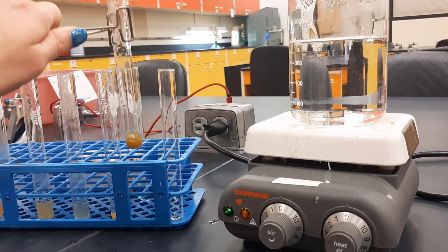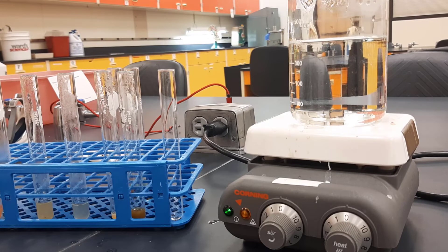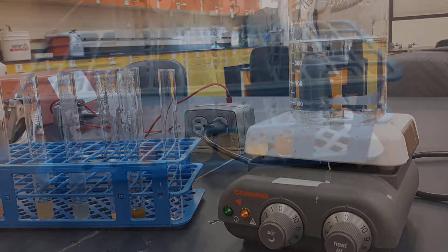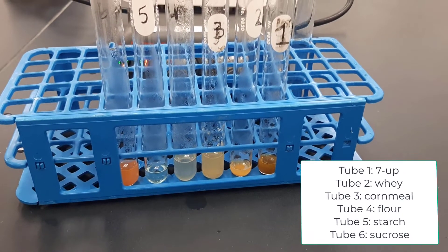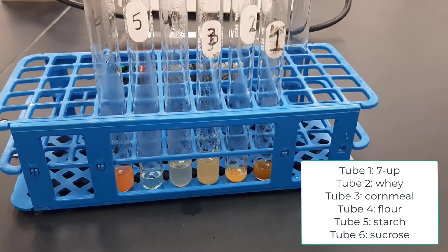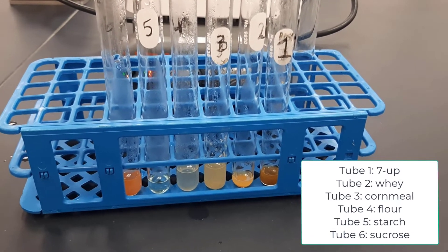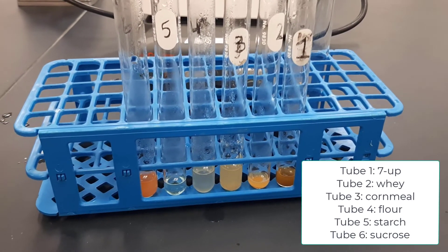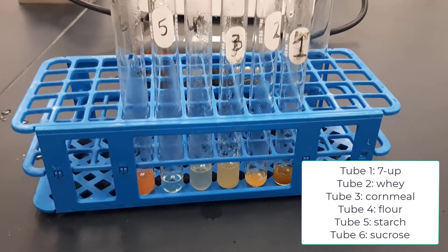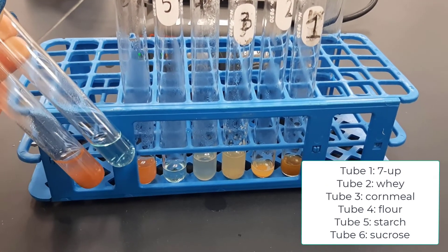Typically, the closer to red the color is, the more reducing sugar there is — or the darker it is, the more reducing sugar. Here are our results again. From the right: tube number one, Seven Up; tube number two, whey; tube number three, cornmeal; number four, flour; number five, starch; and number six, sucrose — and comparing them to our positive and negative controls.